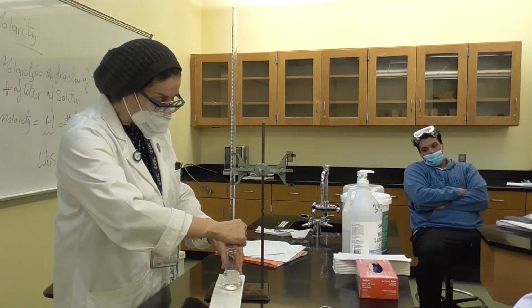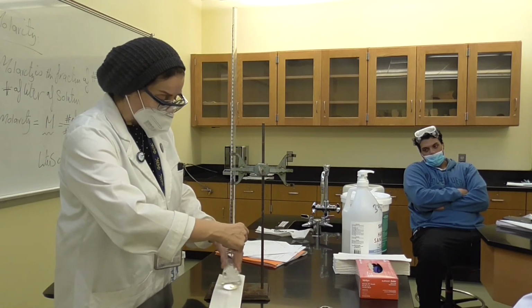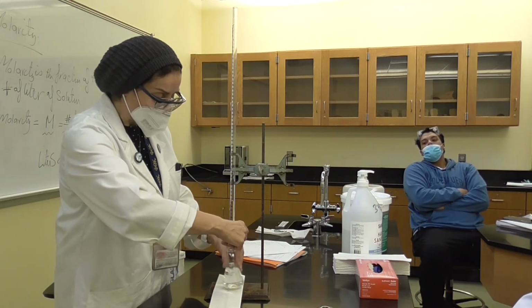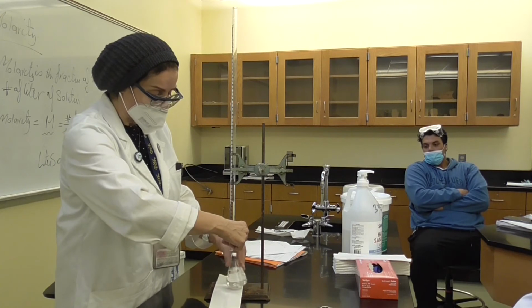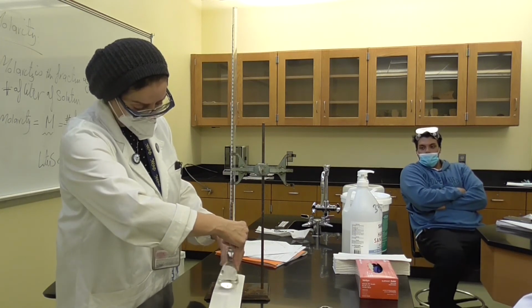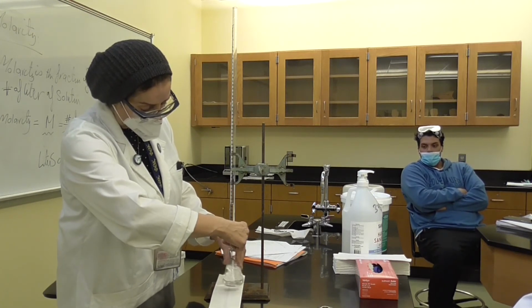So I'm going to make it slower. Yeah, and I'm holding it. The minute I see the pink does not disappear, I stop the dripping, and then I read the burette, how many ml I dispensed. So we are almost there. Don't worry, we are almost there.